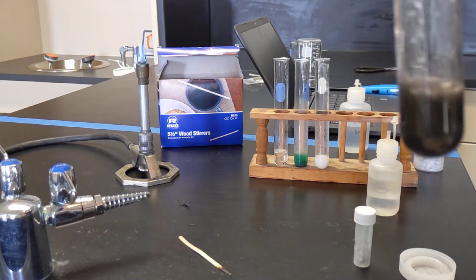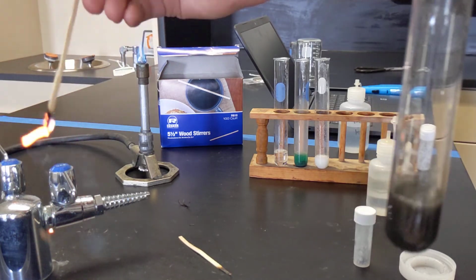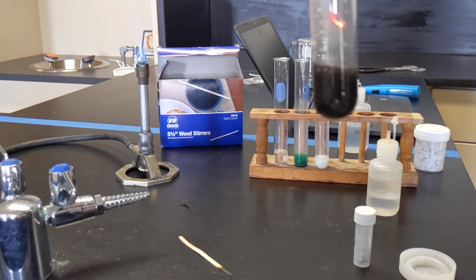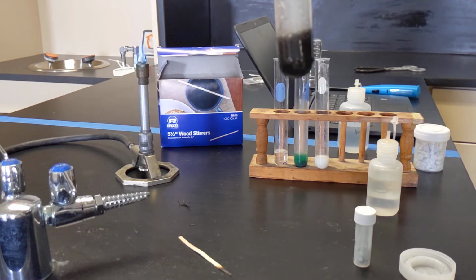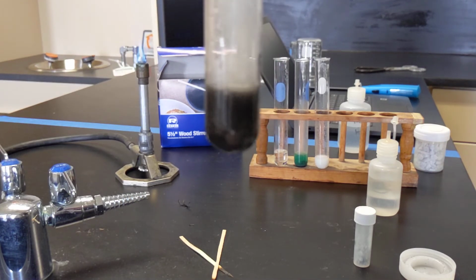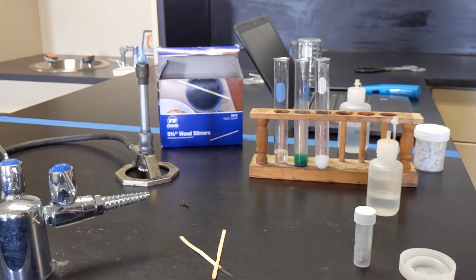So, ooh, and then that glowed a little bit brighter, I could tell. So as I put that in there, the orange turned to white. The glowing orange color of the splint turned to white, and I could tell that it was burning a little bit faster and hotter, but definitely not an explosion.